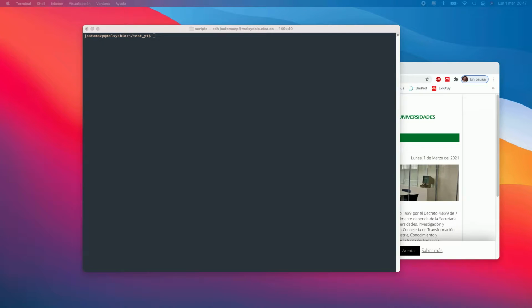So in the last video we were talking about what ChIPnCHOP did, how it worked, what inputs it needed, and which outputs it gave. Now we're going to guide you through an example that is provided in the test folder in the repository.